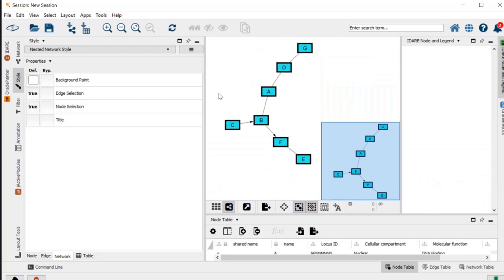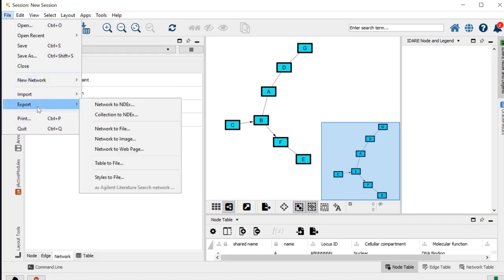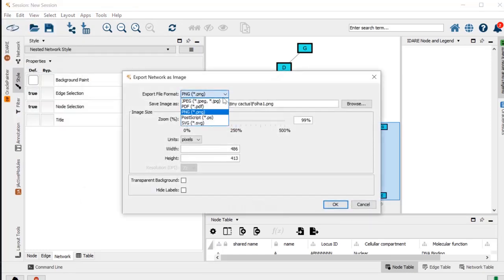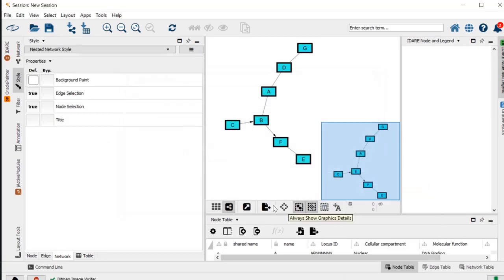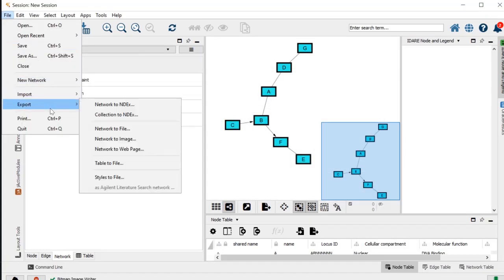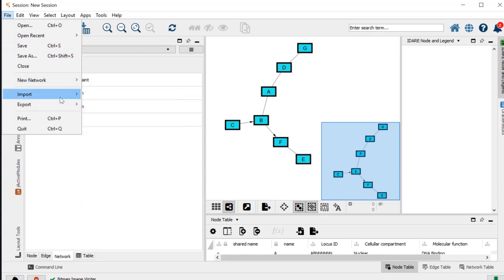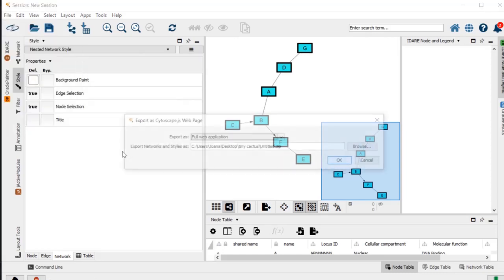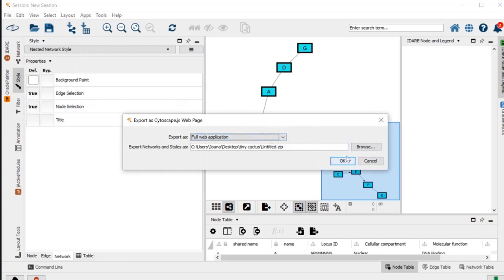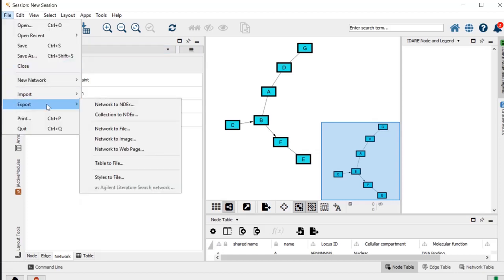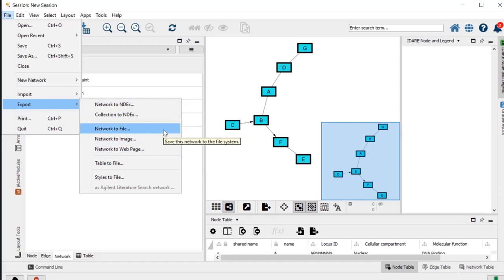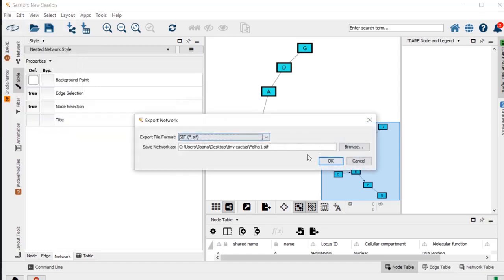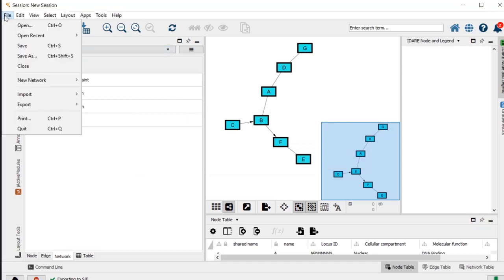Then you can export this, for example, as an image, like as a simple PNG, or you can export it also to an HTML with a webpage with a full application, which I don't think is working properly yet. You can also export it to other formats, and obviously to file, to save it as a CYS file or a Cytoscape file that you can work on later.